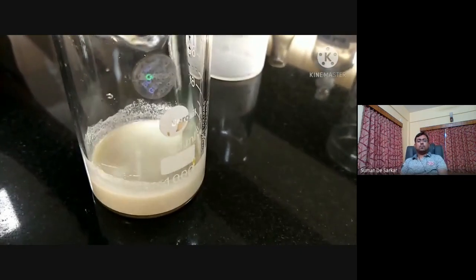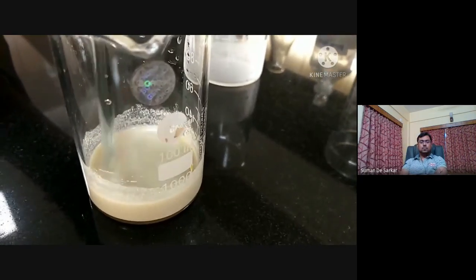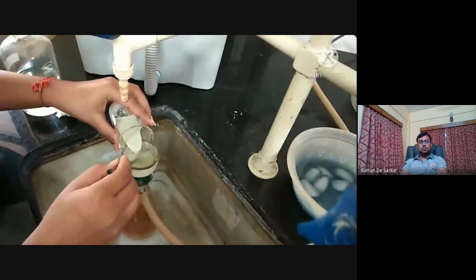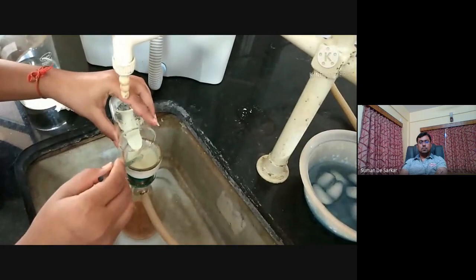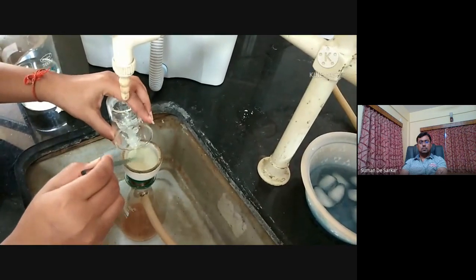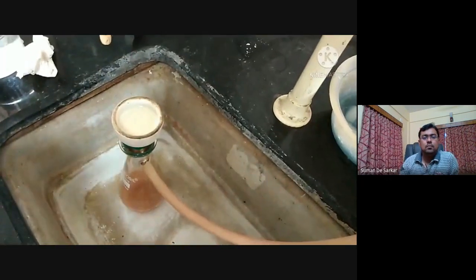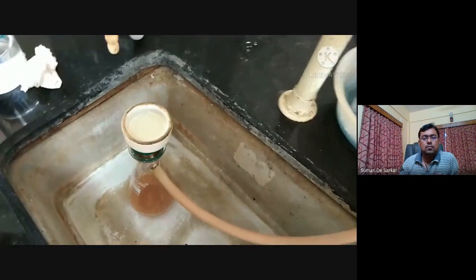And then we'll do the TLC to show you how to characterize or differentiate whether the reaction is complete or not. Filtration here, as usual. Very milky white reaction mixture, giving a very nice product on filtration.